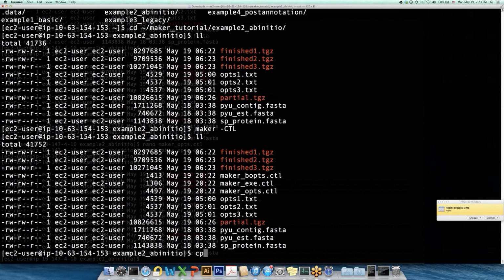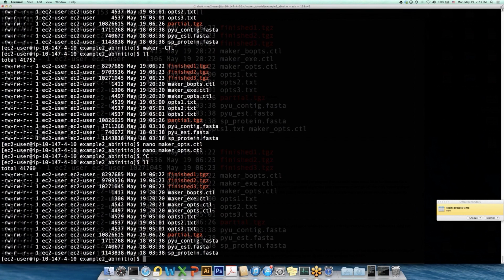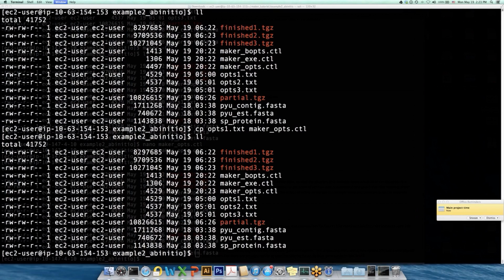On this one, just to make it fast, I'm just going to copy this straight to here. That will fill out the data. Okay. So now I have two instances ready to run, an extra large instance and a medium instance. Okay, you don't need to run this.